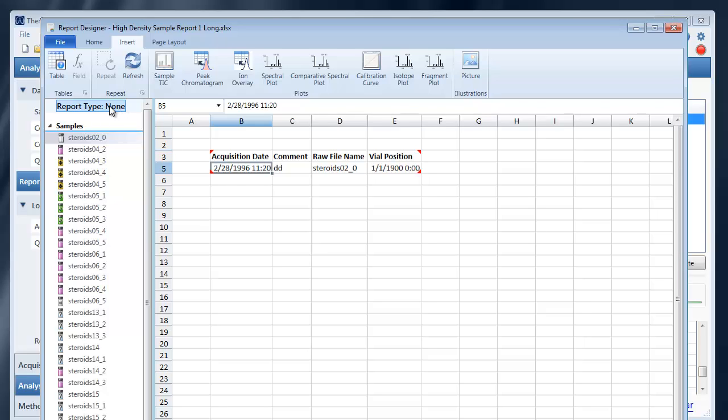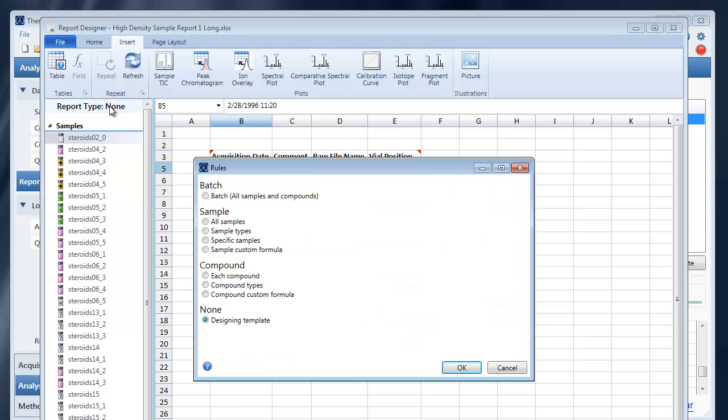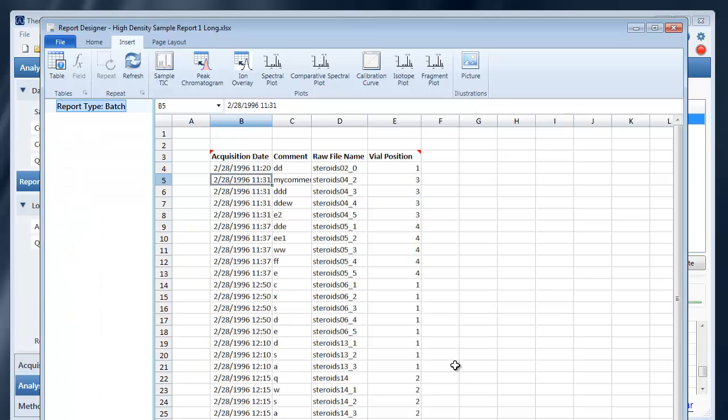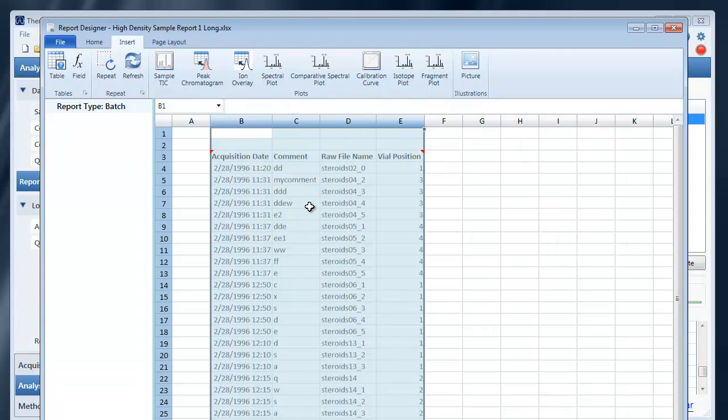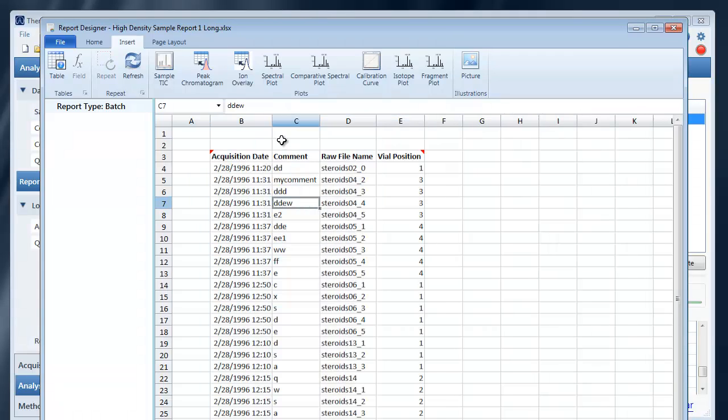Let's make this a batch report so that it does not filter by sample and I can see all of my samples. I can auto adjust the width of these columns.